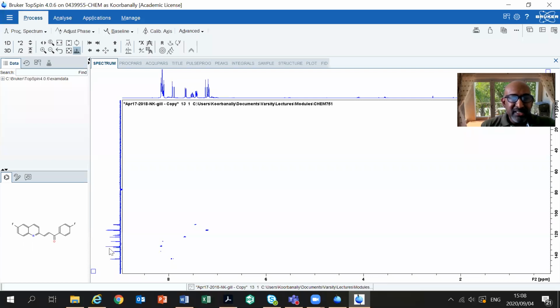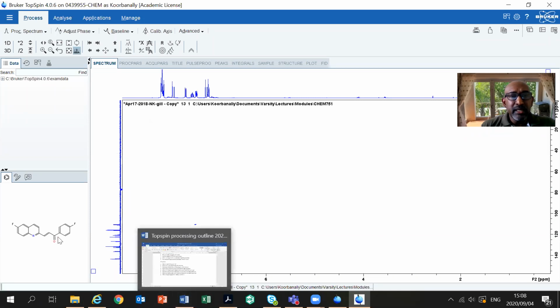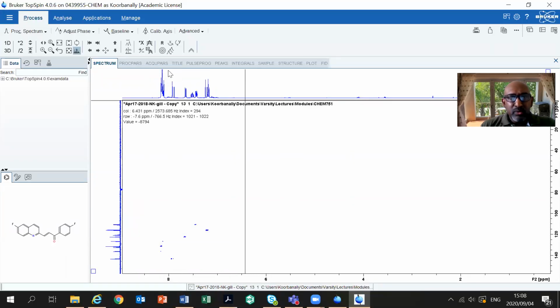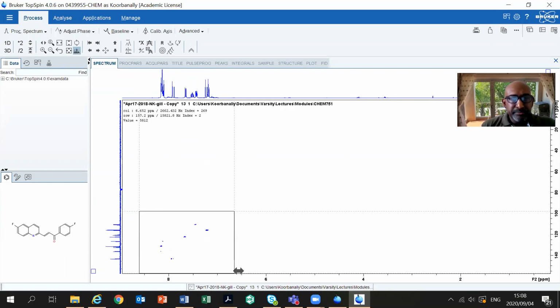And remember, it's quite interesting now because I discussed coupling between fluorine and carbon with you yesterday, and I identified these carbon resonances. And in today's lecture, I identified the proton resonances. So we're going to verify now, I said tentatively previously, whether what we did tentatively is actually true, by using this HSQC spectrum. I only have peaks in this region and this region, so I'm going to expand that particular region.